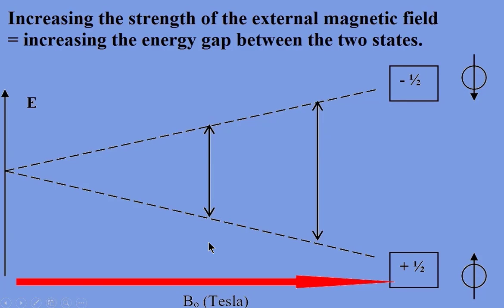However, sometimes it's other factors which are at work which cause the nuclei to feel a different kind of field strength. Whatever the actual external magnetic field B0 is, they could be feeling an external magnetic field which is greater or less than the original external magnetic field.